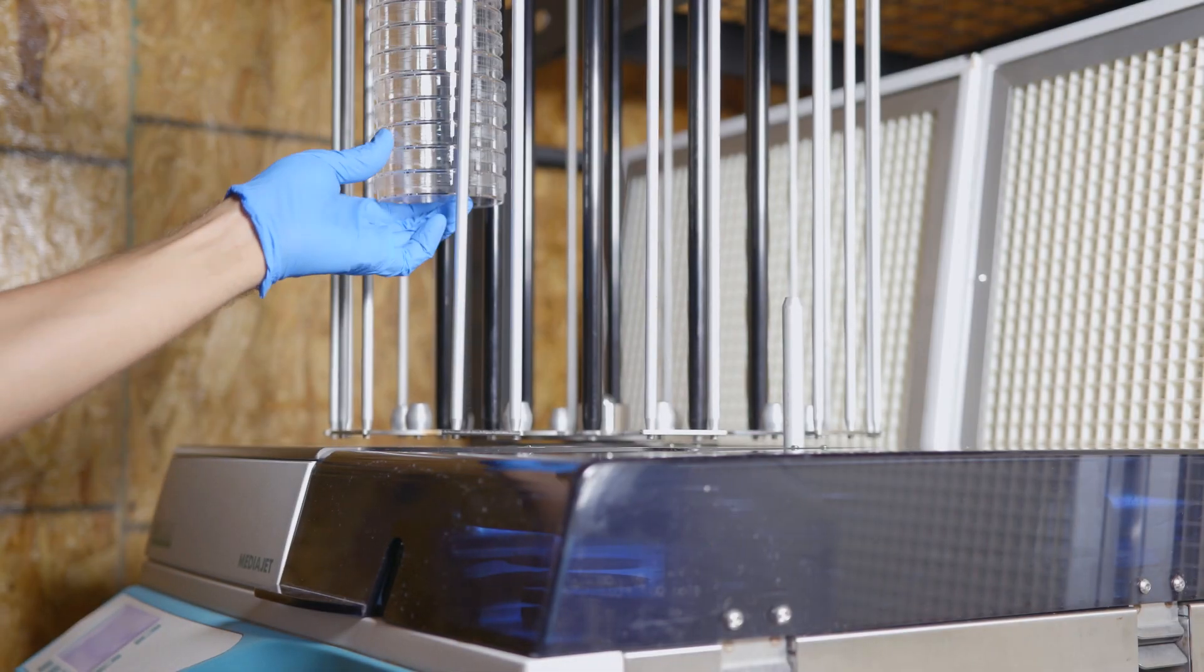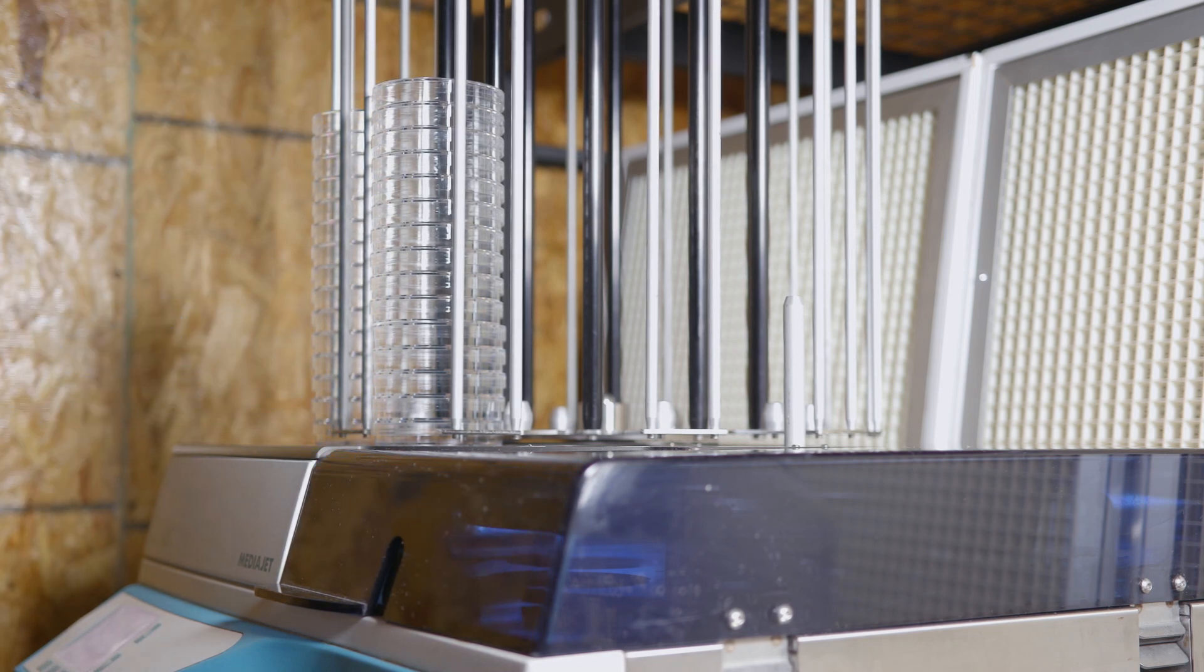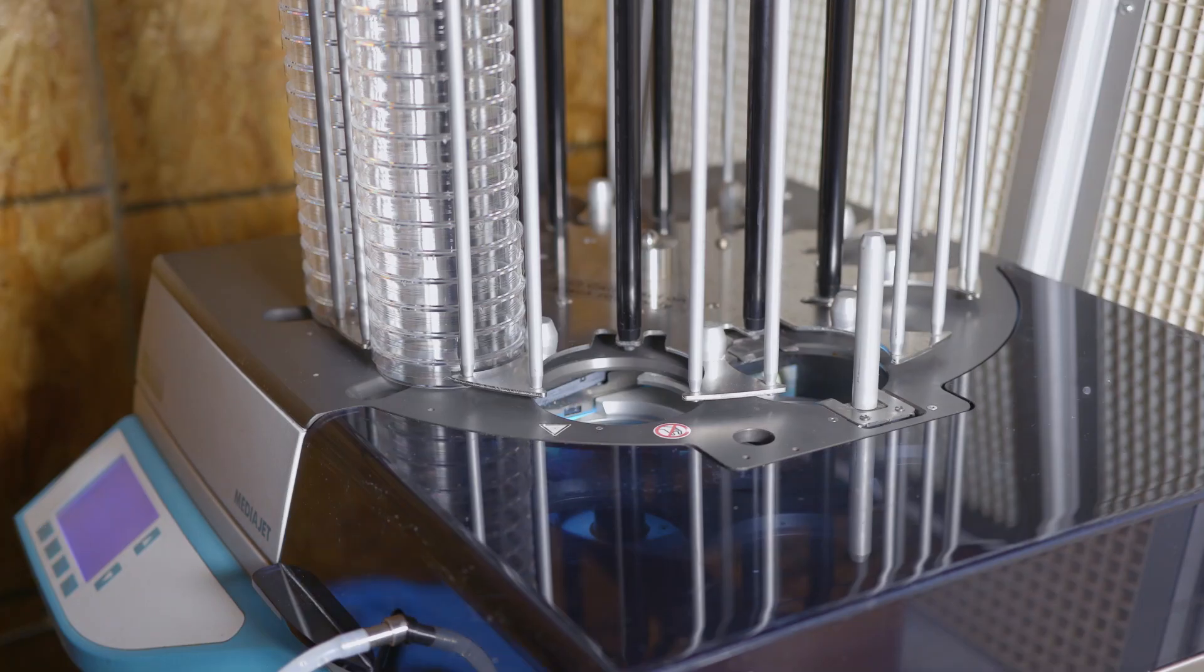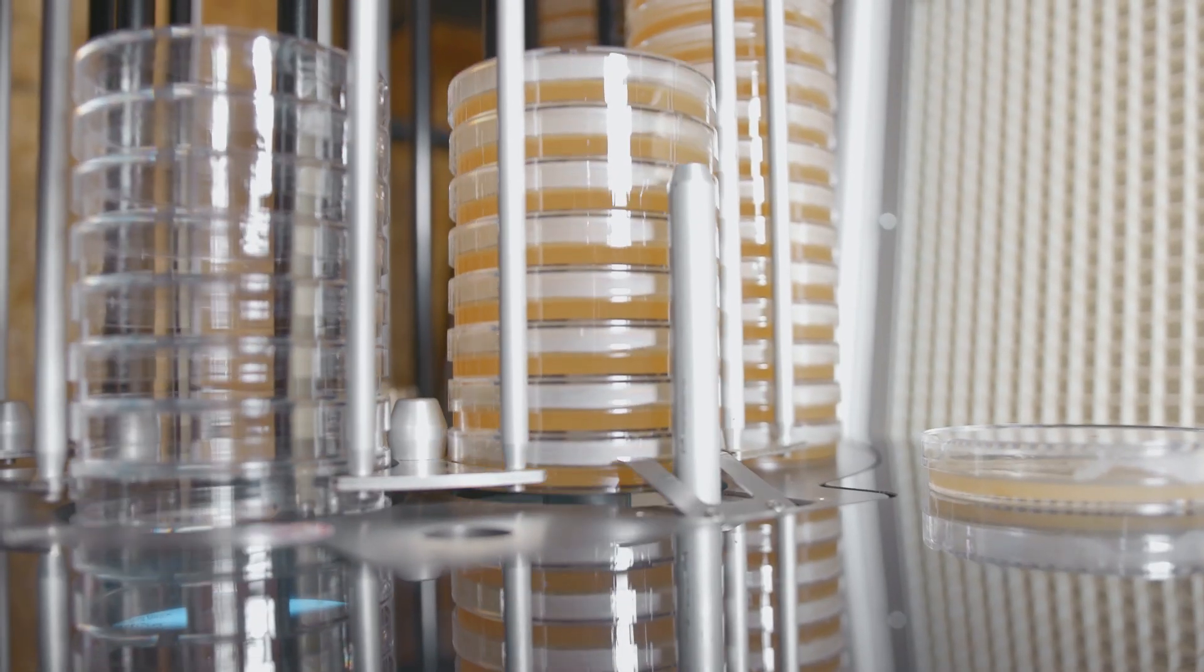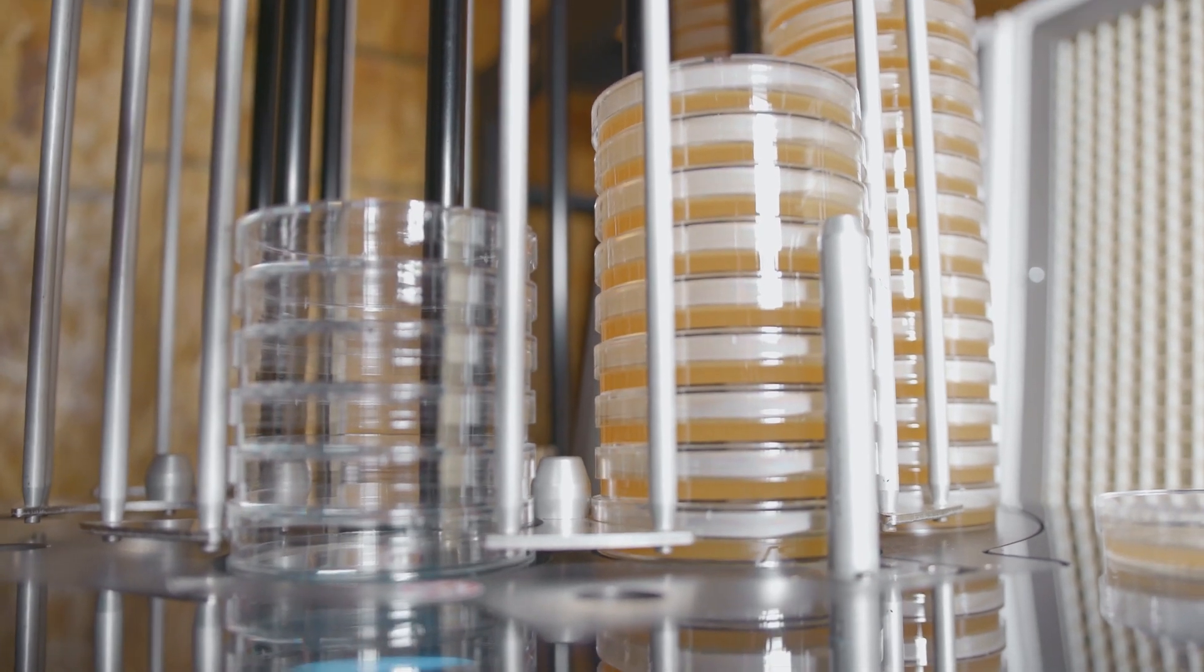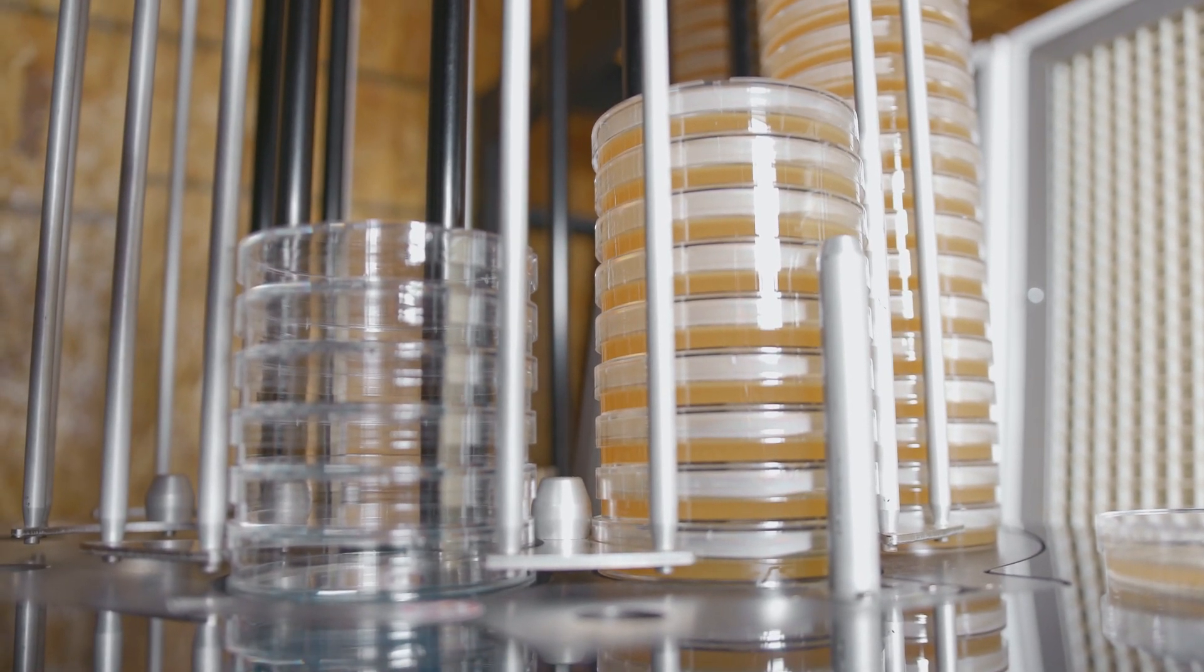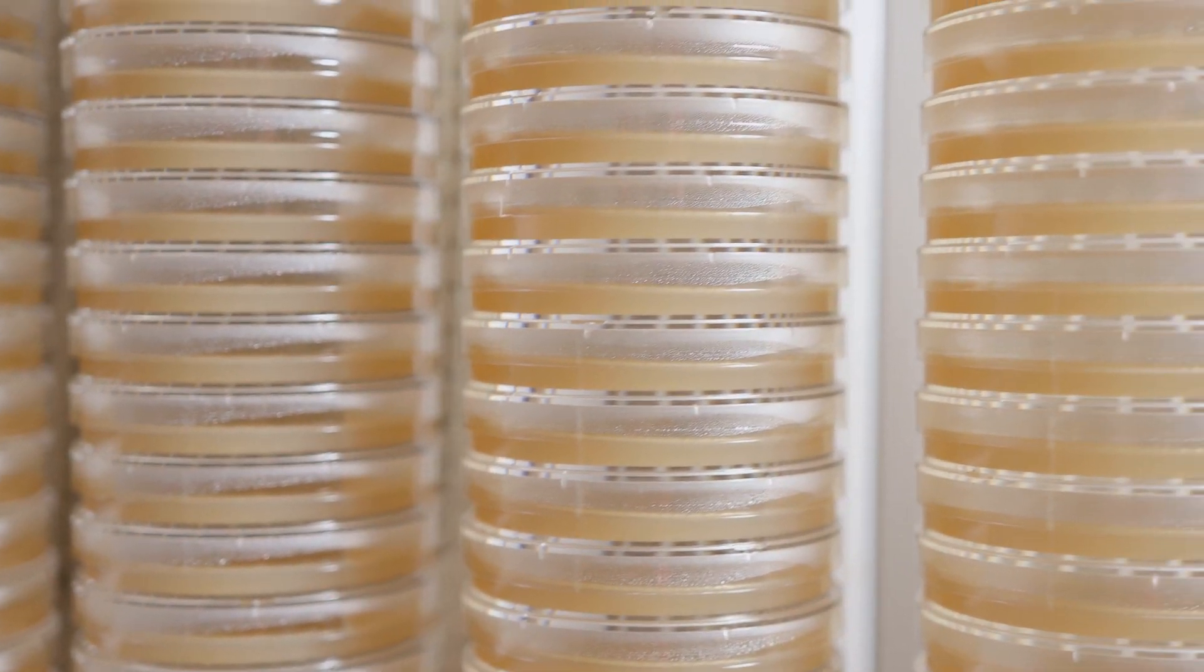So if you're ready to ditch those dirty syringes, then we have a few products that will get you there quickly. This is a new automated plate pourer that we just invested into. It works by loading petri dishes onto a rack, which the machine then lowers onto a revolving carousel one at a time. The carousel spins around a UVC antibacterial lamp and precisely fills each dish with the media. The dishes then continue around the carousel where they're lifted back up onto the rack for further cooling. This machine is typically used in high-end laboratories and it costs 30 grand brand new, but it allows us to offer completely consistent petri dishes for your mycological needs. We'll offer petri dishes both with and without antibiotics in varying quantities, so they're perfect if you want to skip the whole hassle of pouring dishes yourself and want to get straight to the isolating.